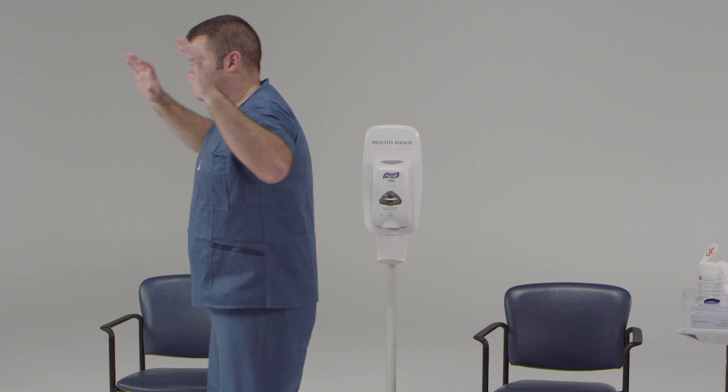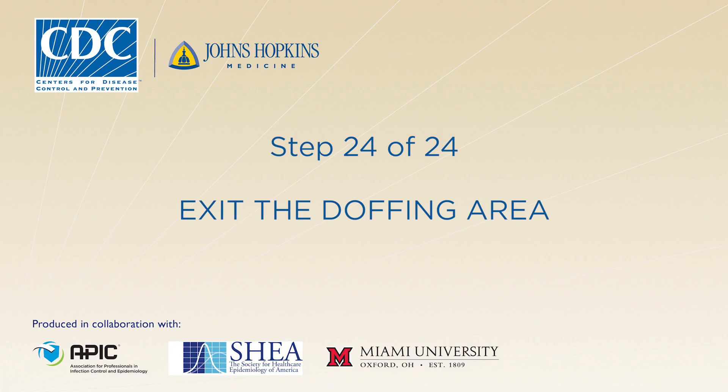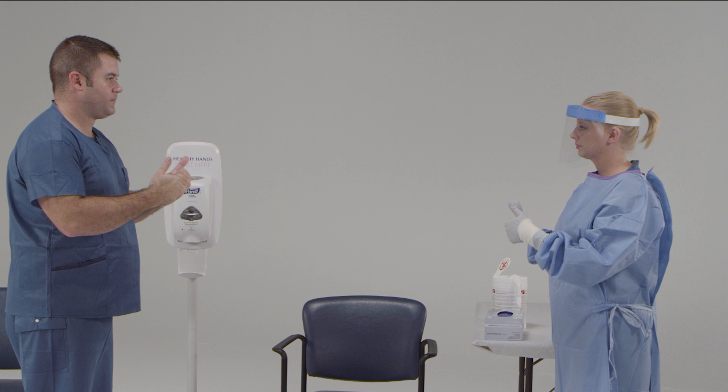One more important step — we need to check for any rips, tears, or contaminants on your clothes. Congratulations! You've now successfully finished the doffing process, so you can leave the doffing area. You need to find the closest designated shower where you can remove your scrubs and bathe with soap and water. A shower is recommended at the end of each shift for the comfort of the healthcare worker.